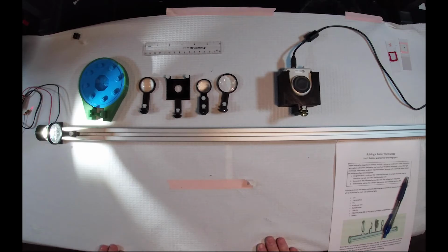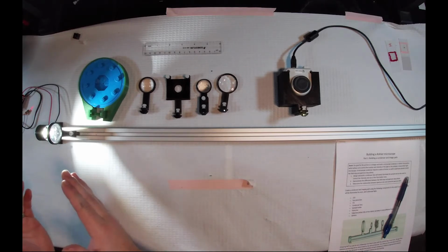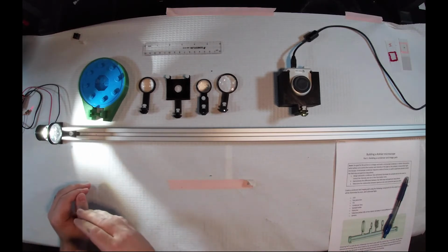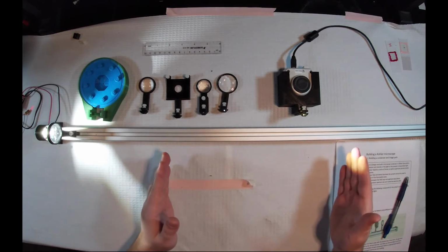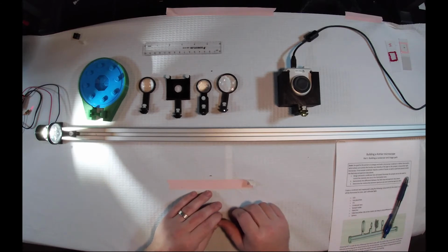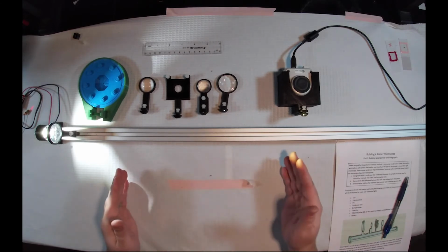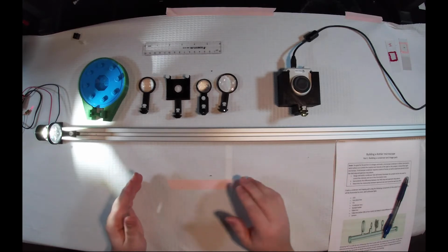Okay, welcome back. We are going to be doing Lab 5, so we're going to be taking everything that we've learned before with how to collimate a light source, how to evenly illuminate a sample, how to make an infinity corrected system, and how to use a digital camera in order to create sort of the complete setup of a digital Köhler microscope.